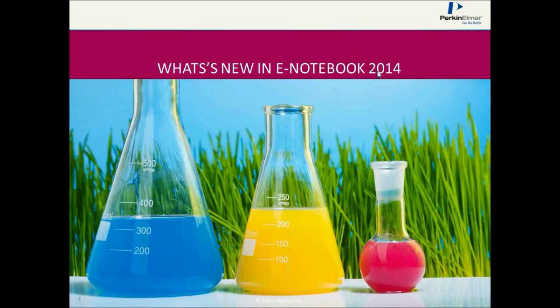Today I'm here to provide you with a quick induction to what's new on eNotebook 2014, to go through the application and show you a couple of examples of things that are new in the application, to help you with the process of testing it prior to the release to the general public.